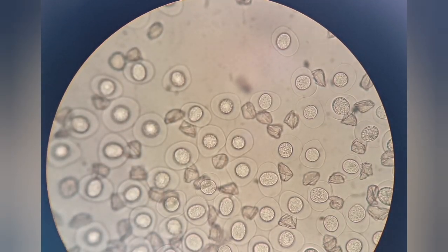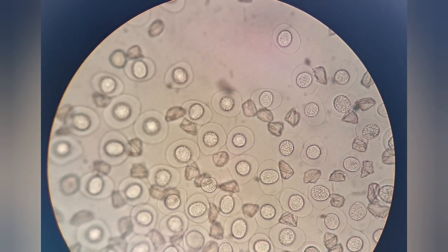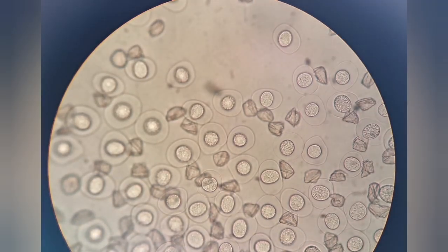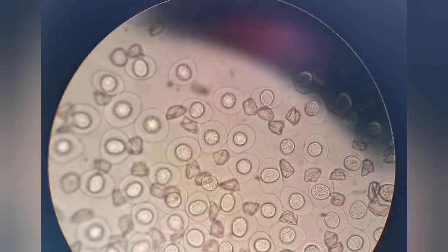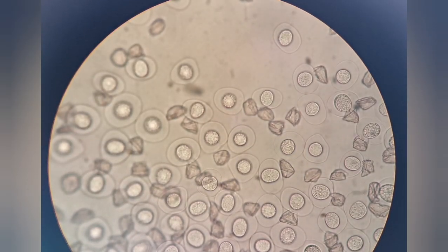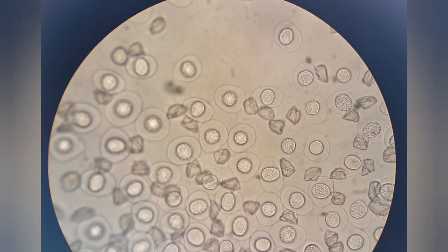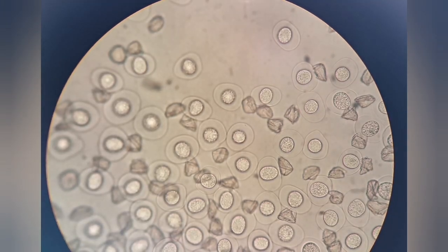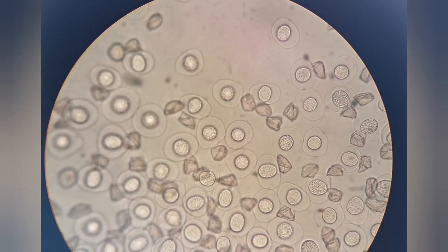But I wonder what you could fix them in. You might be able to fix them with balsam, some kind of balsam. Well, you could fix it, but I was thinking of fixing it in graded alcohol. Just make 50, 75, and then 100. That's what we used to do.